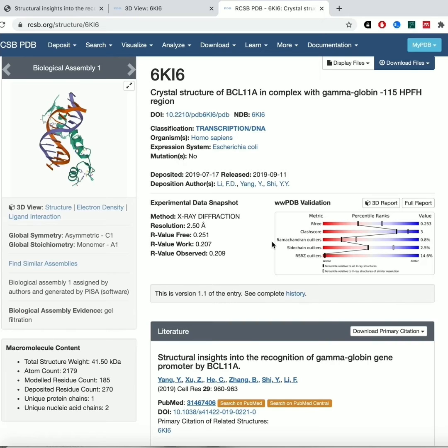Basically, when you're making the model, you want to make sure that you're not overfitting it. It's like the idea that if you have a curve and you were to use a quadratic formula or whatever, if you keep adding exponents, you can get the curve to fit your data a lot better.